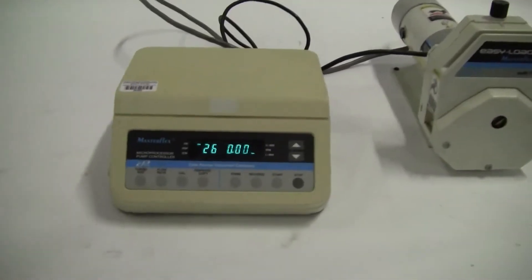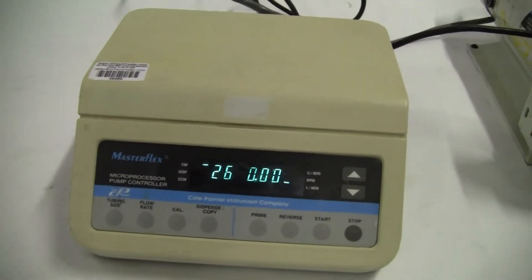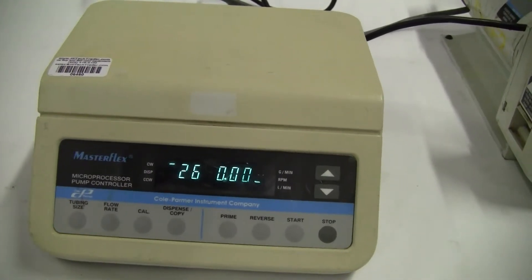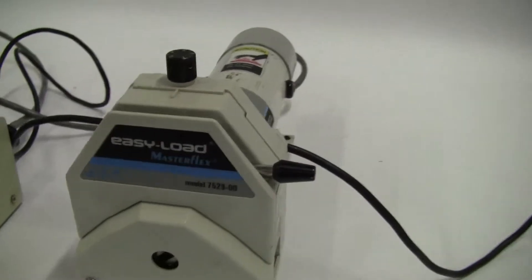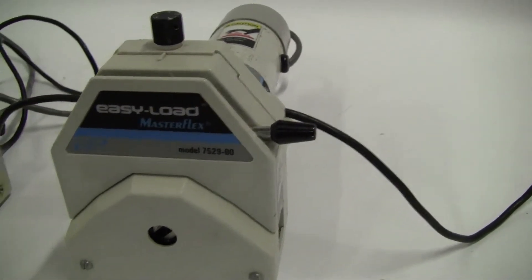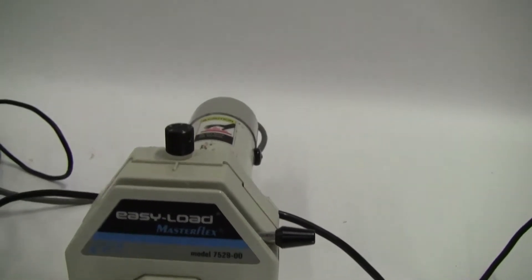Start with the pump controller. It's a microprocessor pump controller, model 7592-60. Then we go to the easy load pump head, model 7529-00, and the Kohl-Palmer pump drive, model 7592-50.